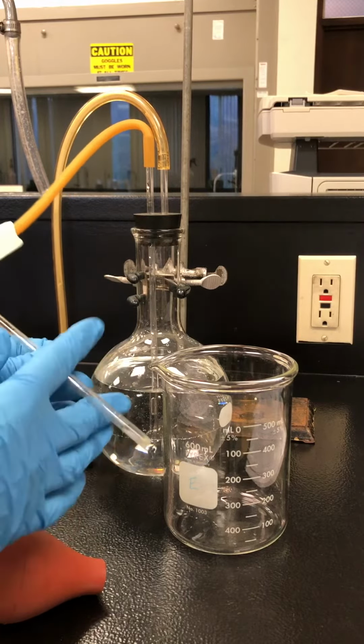And what we're going to do is we're going to add a little bit of suction to the end of this until all of the air is completely evacuated from this line. And then I'm going to pinch this closed with my other hand. So it takes a little bit of practice. Try to do this with both hands. So we'll see how this goes in my attempt to videotape it.